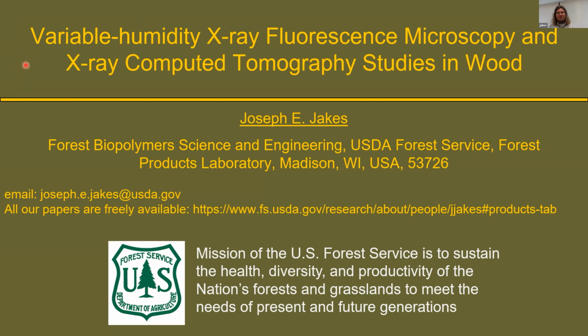It's a great pleasure to be here to talk about the work that we've been doing at the Advanced Photon Source over the past 10 years or so. I'm going to focus today on some variable humidity experiments that we've been doing at Sector 2 IDE using X-ray fluorescence microscopy to study diffusion through wood cell walls, and also at beamline 2BM using X-ray computed tomography to study moisture-induced swelling and shrinking within the wood cellular structure.